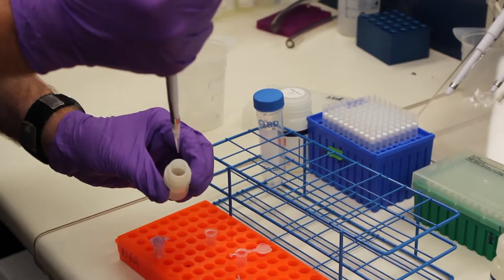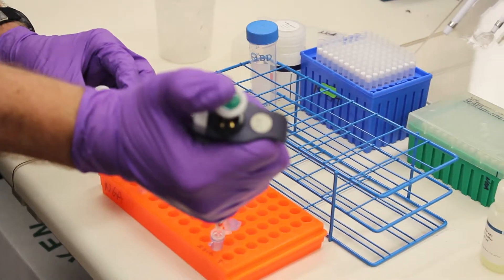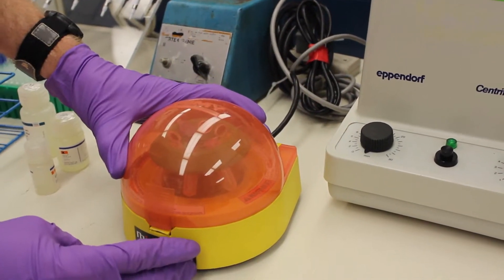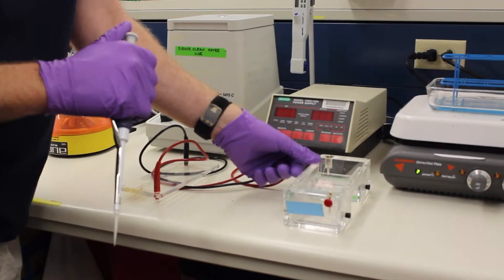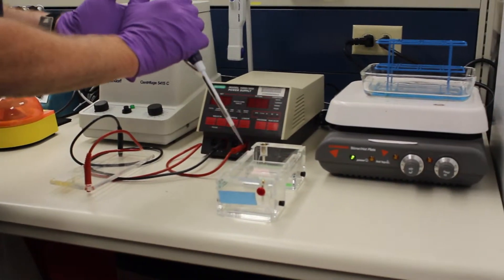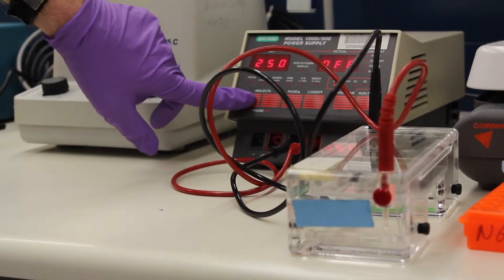Once we collect our sample, we'll take it to the lab and add a DNA extraction buffer. That lyses the cells — it breaks them open to free the DNA out of the cells. Then we run it through a number of different steps in order to isolate the DNA.